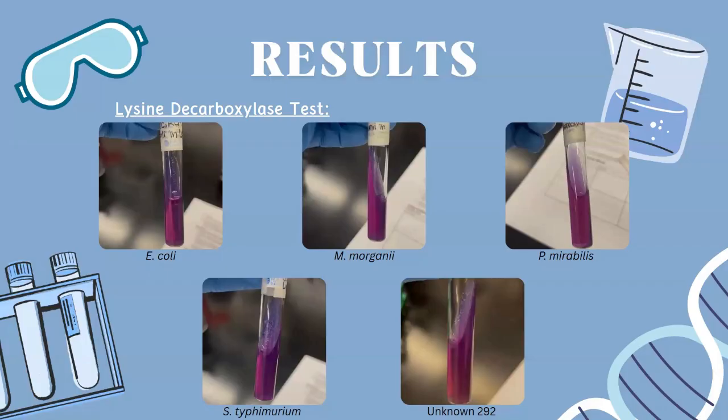The only one that maybe has a slight tone shift is unknown 292, which appears to be a sort of pinkish towards the bottom. So I don't know what could have gone wrong for our results. Maybe we didn't streak enough bacteria. Maybe our bacteria was contaminated, or who knows.